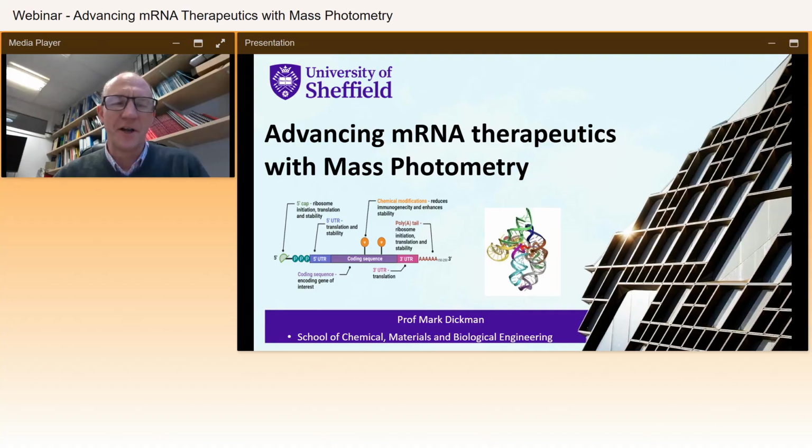Thank you very much for the introduction. Today I'm going to talk a little bit about some of our recent research at the University of Sheffield, where we've been utilizing mass photometry to characterize and analyze mRNA therapeutics.